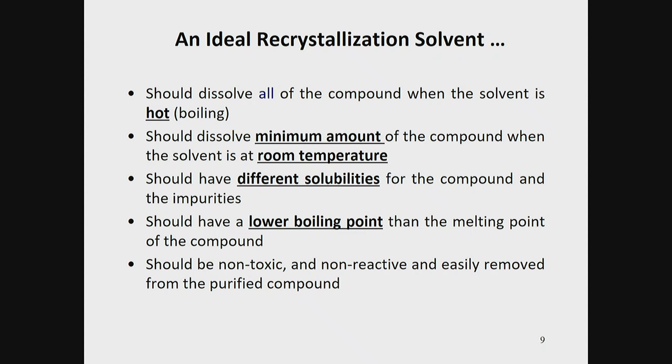So you see there are all of these requirements for the ideal recrystallization solvent. Another thing is that the solvent should be non-toxic. Why? Because you're working with this chemical and you don't want to get contaminated. And it should be non-reactive. This is extremely important. We want to be using solvents that are inert, that don't react with the solid we're trying to purify. If they react, they're going to change the composition of the solid.